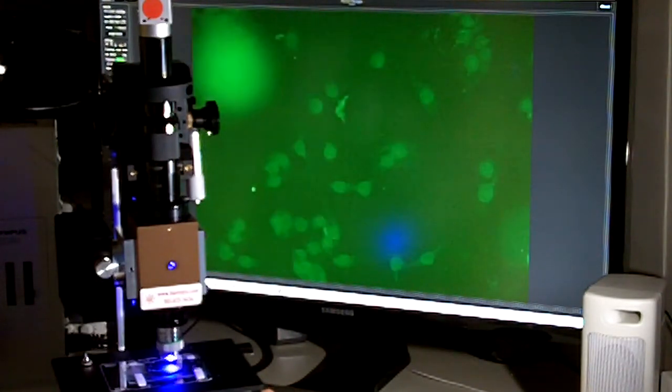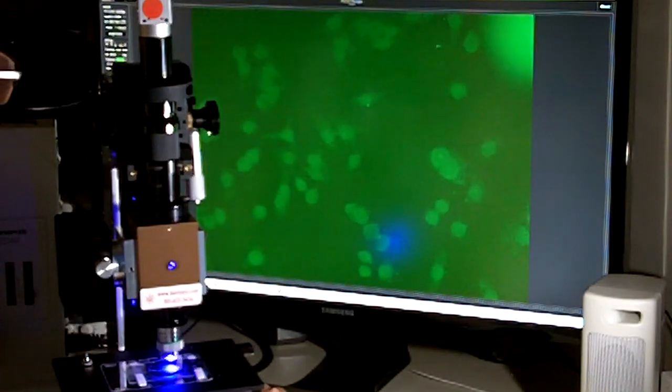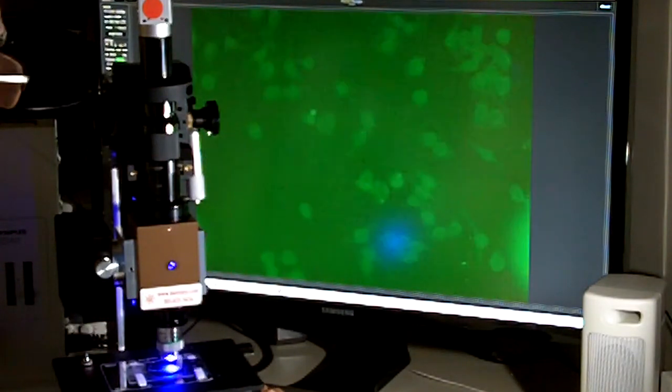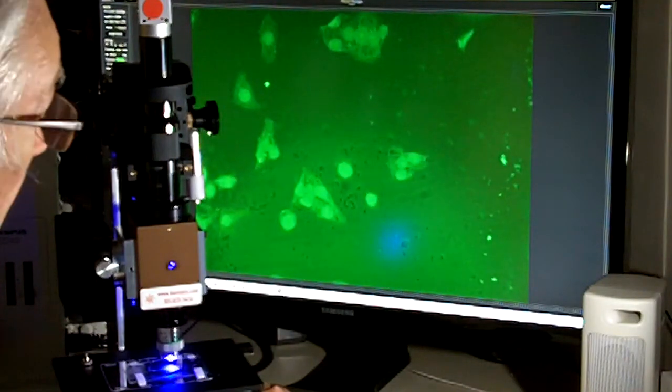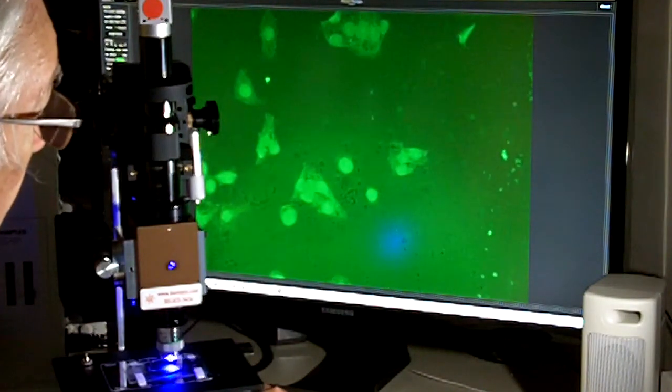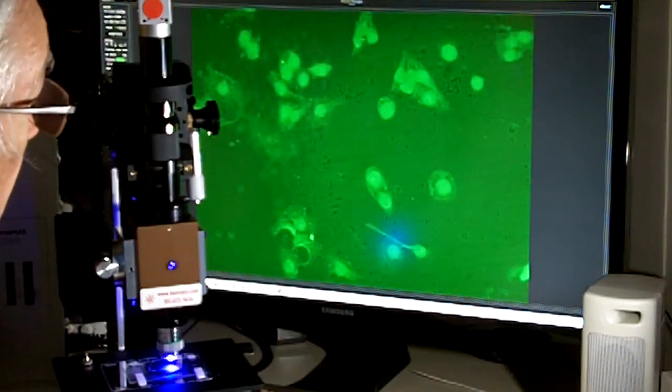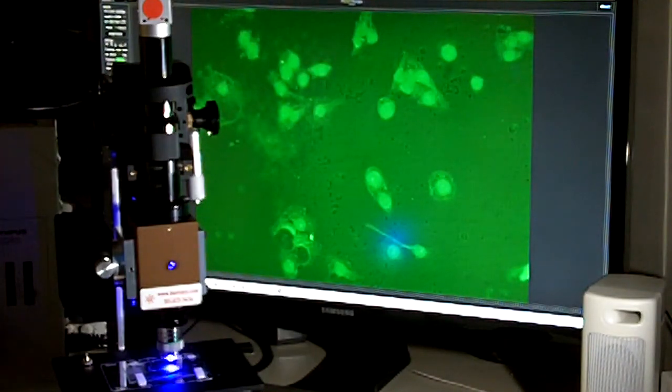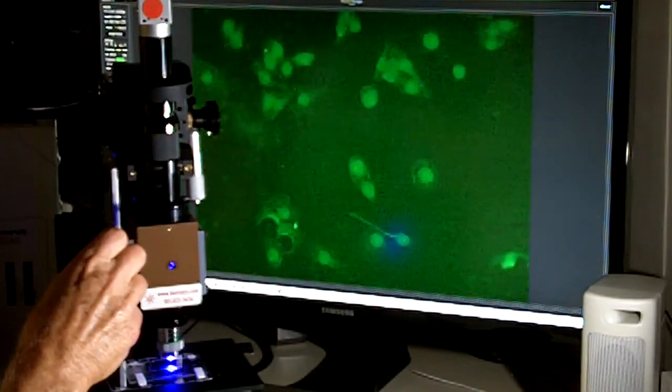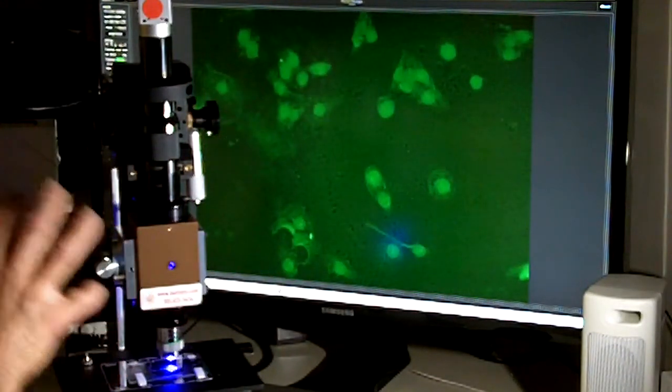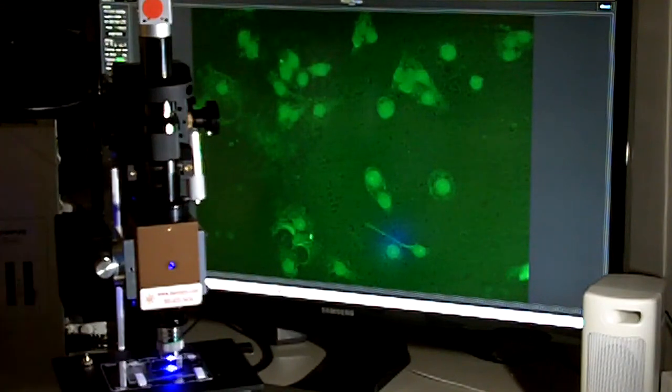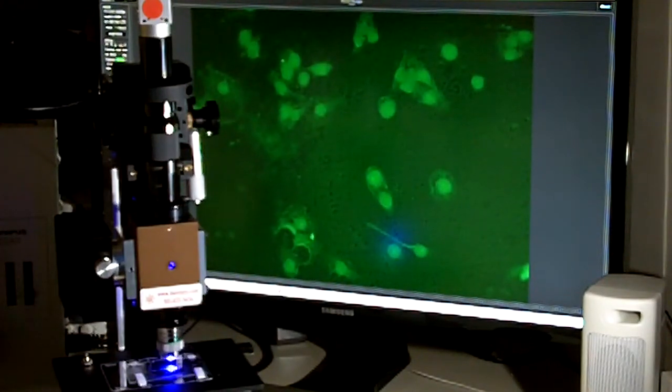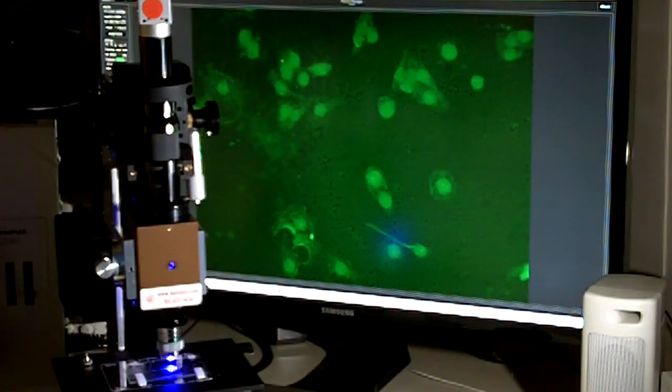So, here again, this is a research type instrument. There's a little brighter signal here because we haven't cooked the fluorophores. But you can see these individual cells quite nicely. And if you don't want to cook them quite as fast, you can turn it down and then play with the gain and the usual contrast enhancing methods with the digital camera can be manipulated.